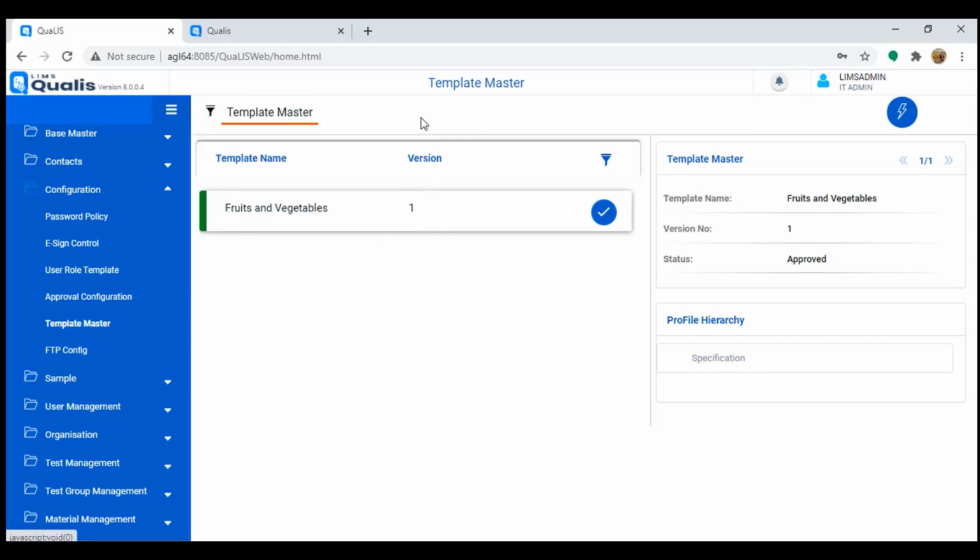Okay, so it is possible. You can have 3 layers, 4 layers. In fact, you can also have different structure for different requirement. Let's say finished product needs 4 layers. Raw material needs 5 layers. That is also possible. We can configure it in that way also, right?